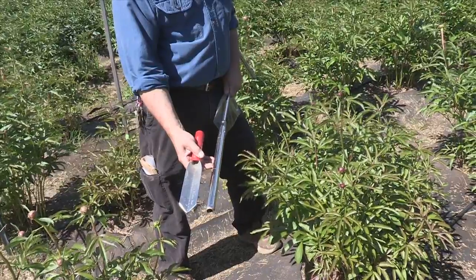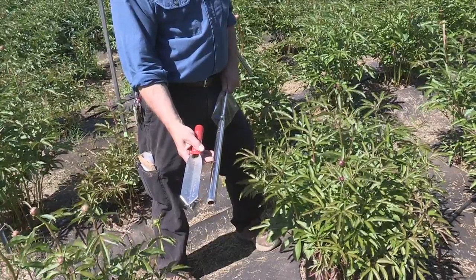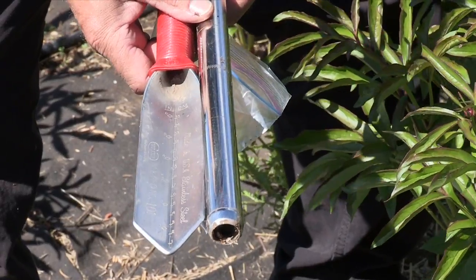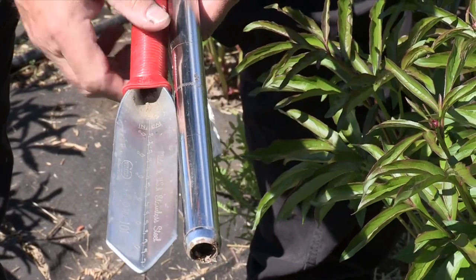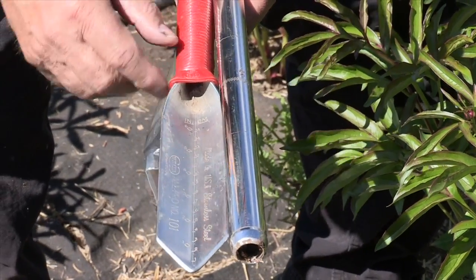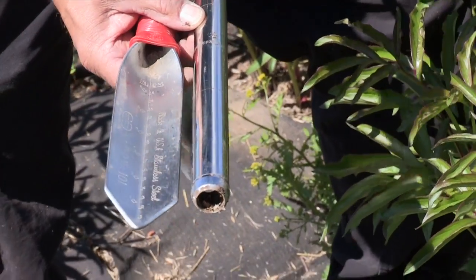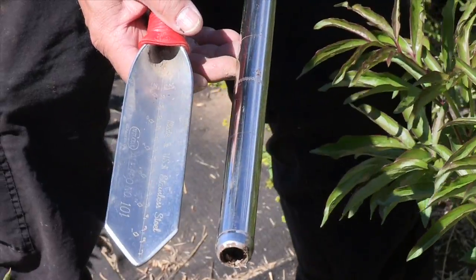You'll only need a 1 inch by 1 inch by 6 inch deep sample. If you have access to a soil sampling probe that has the depth previously marked, then this is a quick and easy process. If you have a trowel, then it gets a little more complicated as you need to dig out a hole first and then collect a sample. It's best if you have a trowel that has a depth measure on the blade.